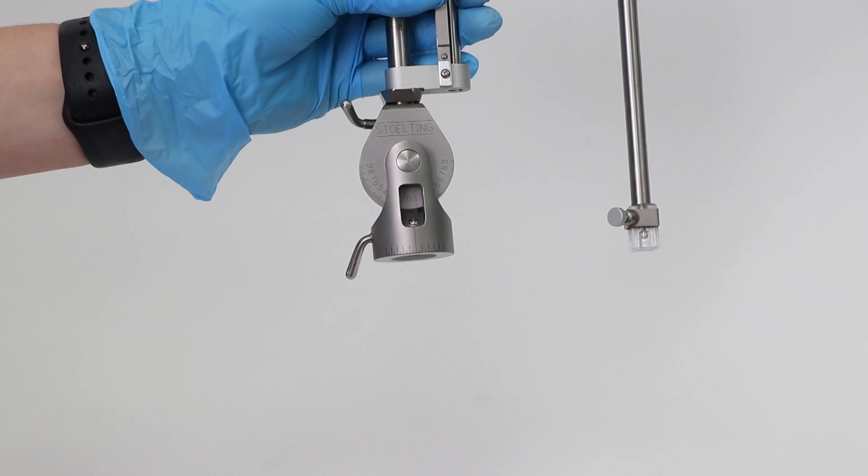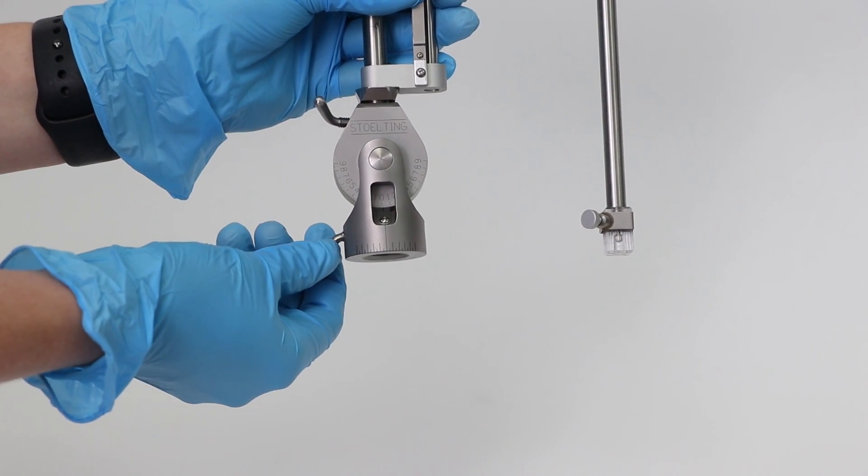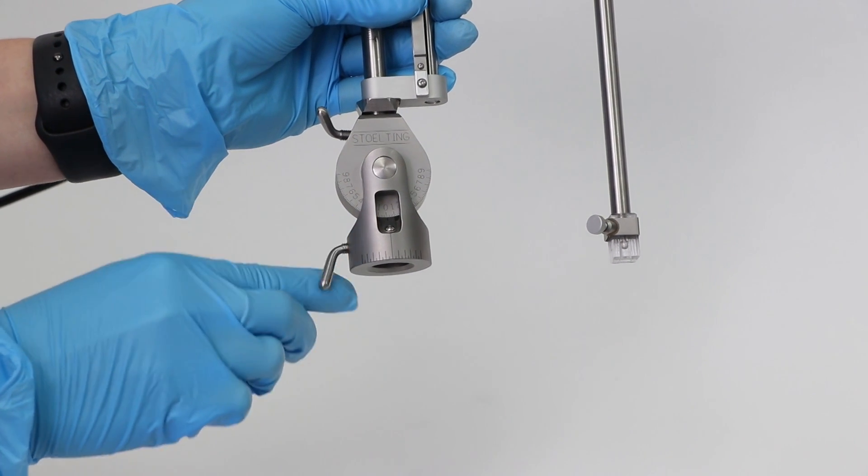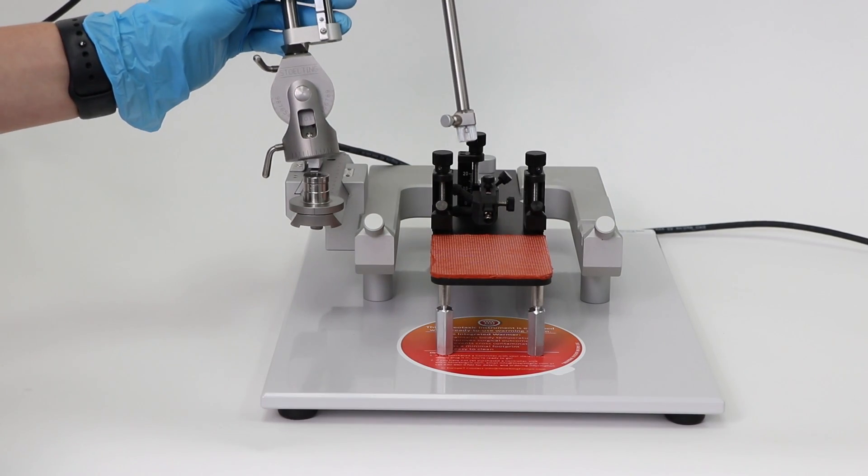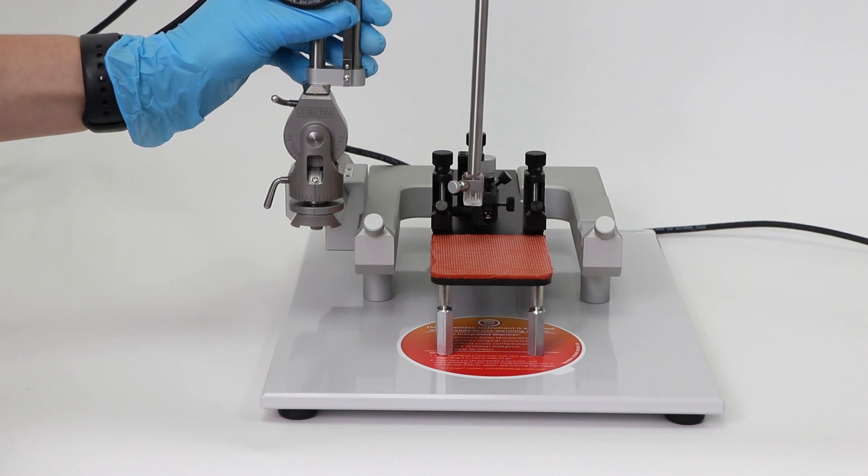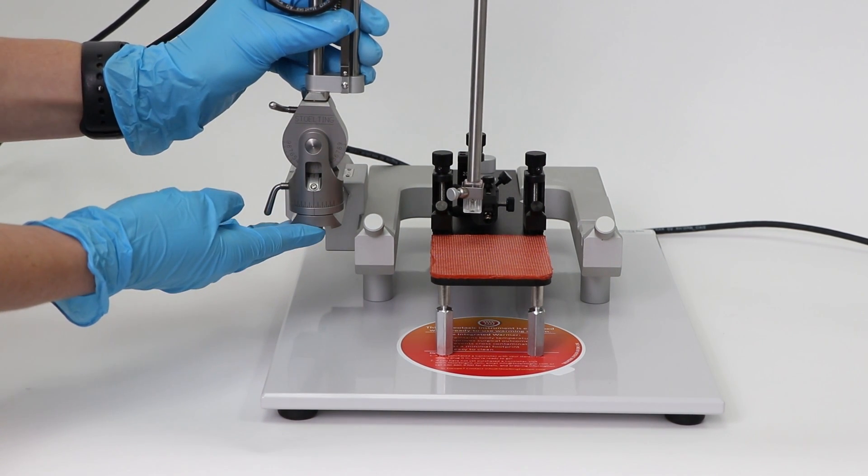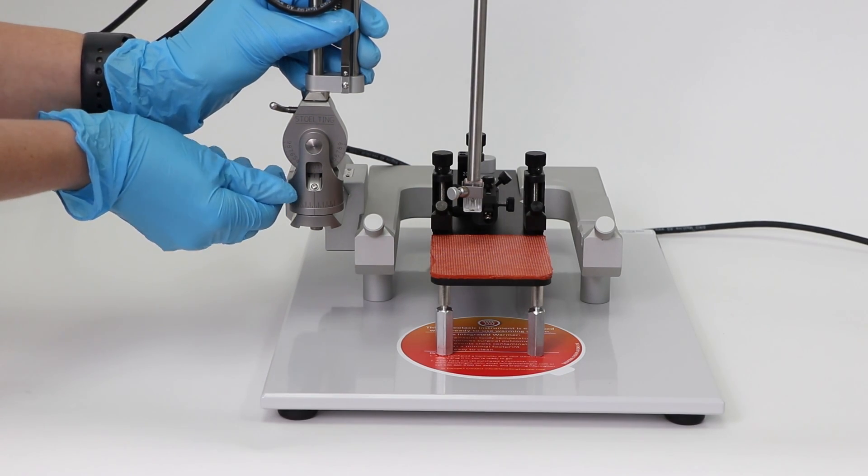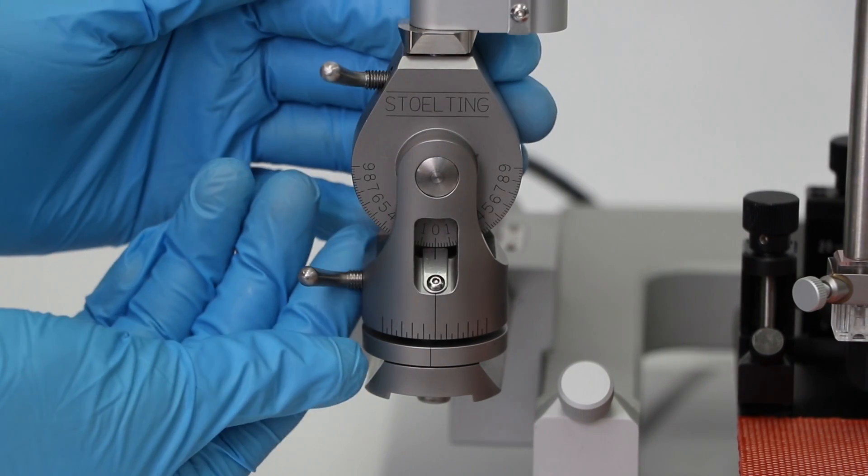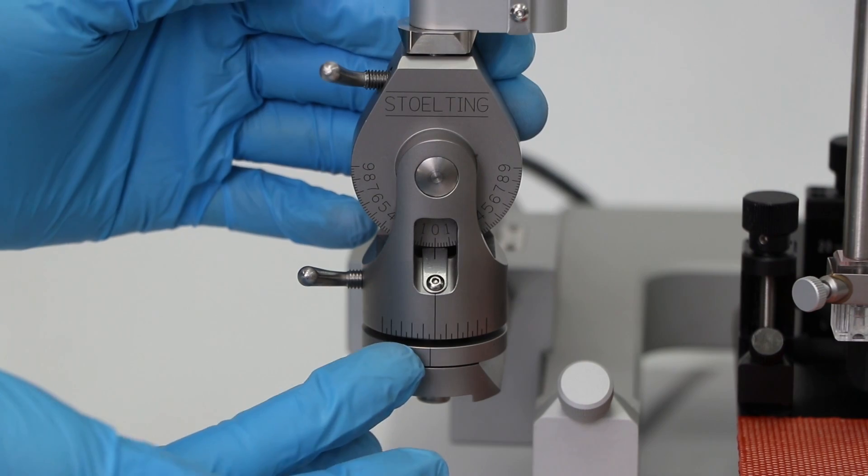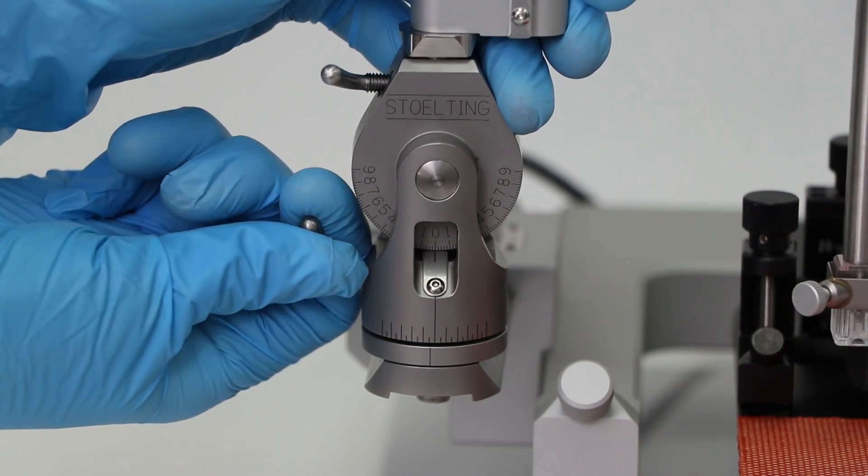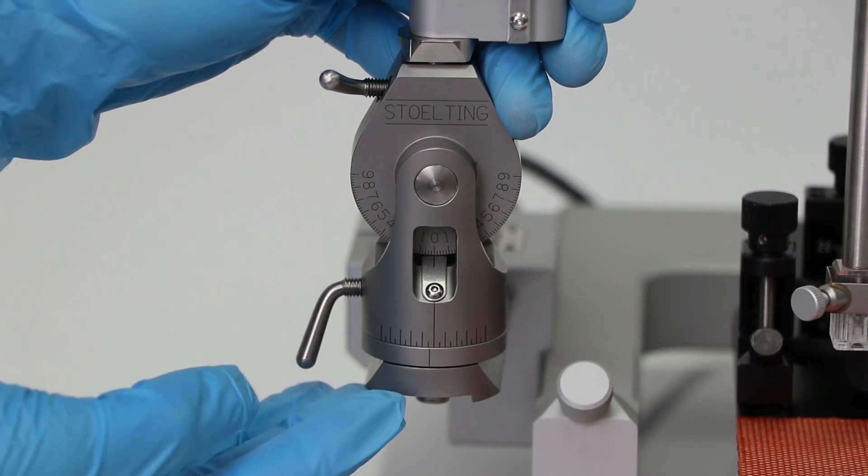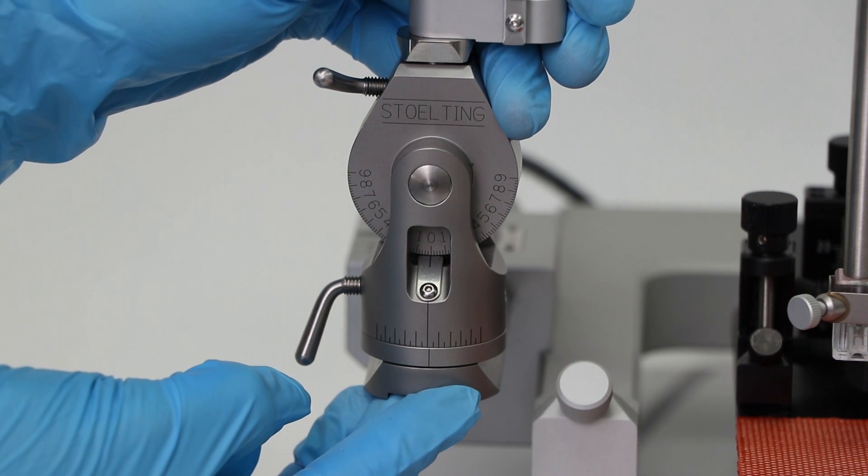Next, take your manipulator and make sure the fastening screw closest to the base is loose. Place it on the anterior posterior knob fitting. Make sure the manipulator is fully seated and secure with the vertical screw once aligned according to the scale on the base of the manipulator.